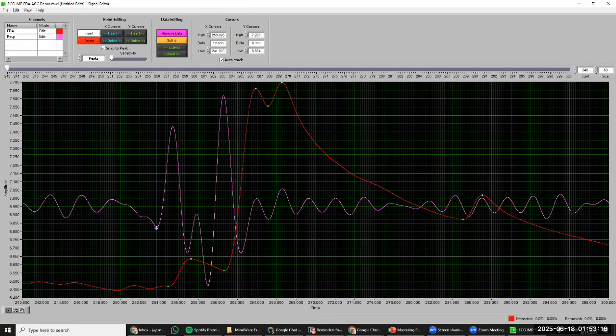So again, I'm going to pick up on the trough location of our pink respiration waveform, and then I'm going to put this window here to get the onset of this SCR. And we can see now, from the trough of the respiration to the point of the SCR trough, the delta is showing us, yes, it is more than a second. It is between that 1 to 3 second window.